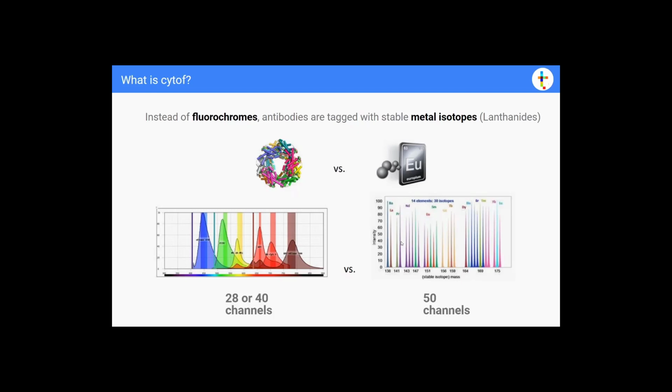detecting wavelengths, or the wavelengths are sharp and they don't walk on each other, and there's much less noise, and therefore you can go up to higher channels, 50 channels, for example. But in the meantime, the flow cytometry world has improved, and there's this spectral flow cytometry, and it's going up to 40 channels. So it's very exciting times with all these parameters coming online.